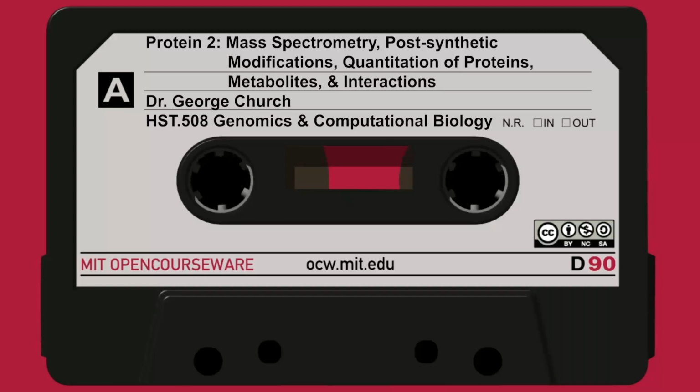You can get away really with, or certainly don't depend on, having 10 to the minus 3 atomic mass units as your resolution. But you do depend upon, in a kilodalton size peptide, being able to get 1 part in 10 to the 4th, 1 atomic mass unit.